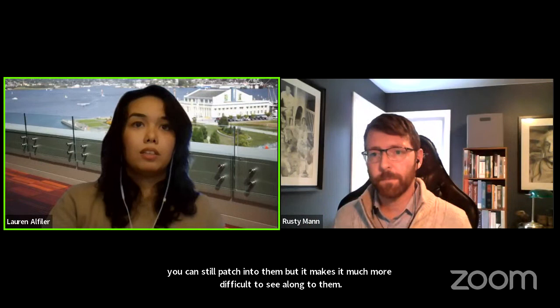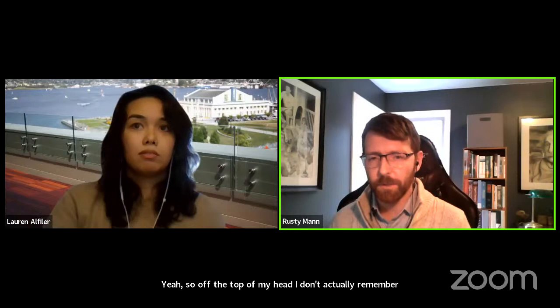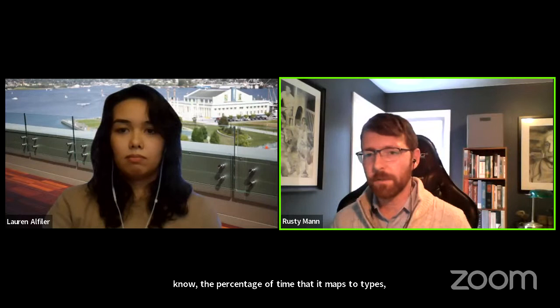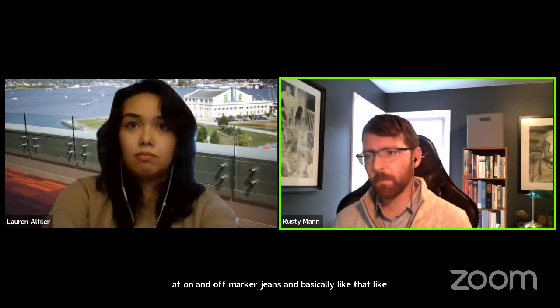I guess there's one more question. For mapping, this one's for you. What is the threshold for high quality versus low quality? For example, would 15% of another type be considered low or high quality? Off the top of my head, I don't remember what the exact percentage would be, and I'll get that in the chat, but it's more complicated than that. We don't just go straight off the percentage of time that it maps to types. There are additional QC metrics that will cause a cell to be considered either high or low quality. I didn't have time to go into a lot of that. Normalized marker sum scoring is another factor we use, which looks at on and off marker genes and the ratio of those for the given PatchSeq cell, compared to the known patch FACS cell types.